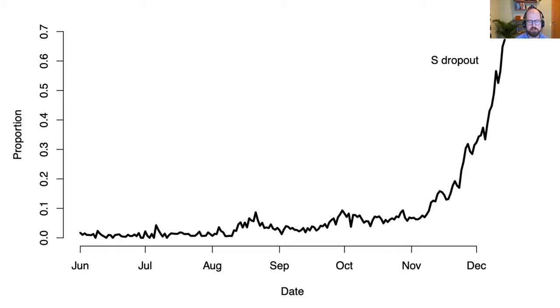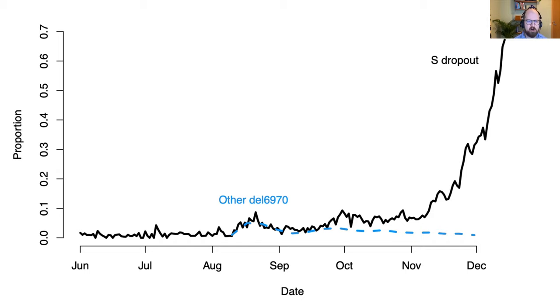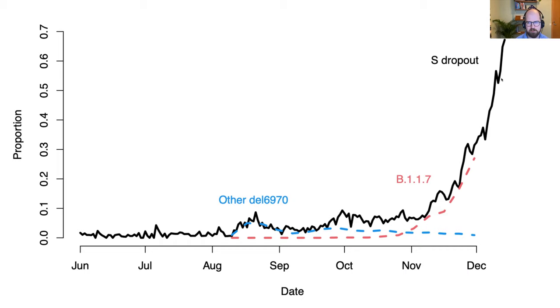Normally if you have any virus you see all three channels light up positive. They use three targets to have redundancy in case of assay failure or if the virus mutates and makes one channel ineffective. One lab that had been testing with this assay showed a massive increase in what they call S dropout or S gene target failure — around 10 or 15 percent in mid-November. Instead of three positives, they were seeing no signal in one of the three channels but strong signal in the other two. They asked us: is this explained by a mutation?